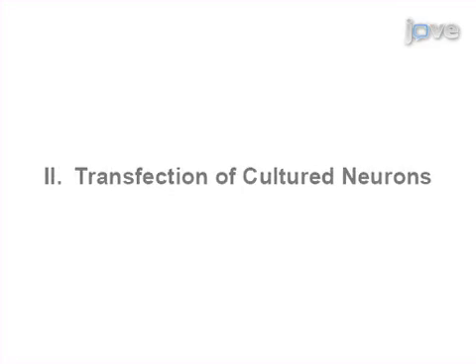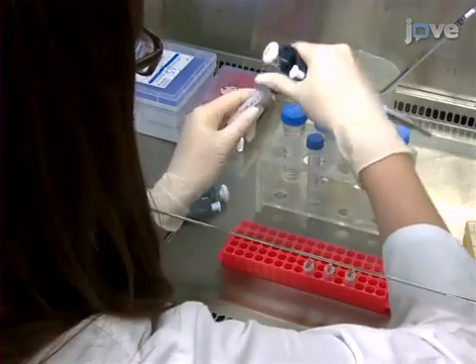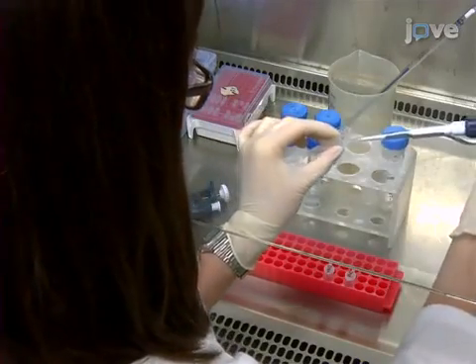Prior to showing the in vivo electroporation of the cerebellum, we will first demonstrate a morphological assay that uses cultured cerebellar granule neurons as a model system.